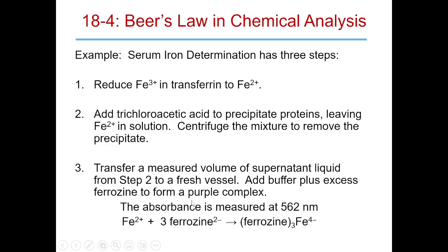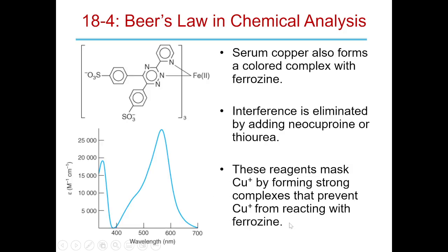Okay, so in this case, we make a purple complex. That absorbance is going to be measured at 562 nanometers. That would be theoretically your maximum absorbance. This is the complex that's formed, by the way, in case you're curious. Right there. That would be your purple complex right there. This is what it looks like.